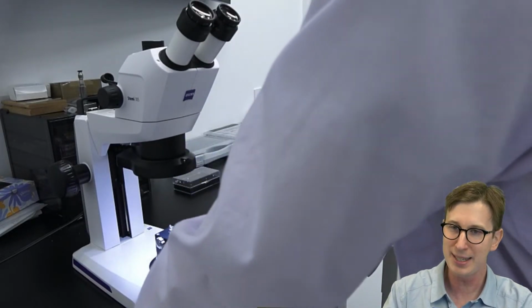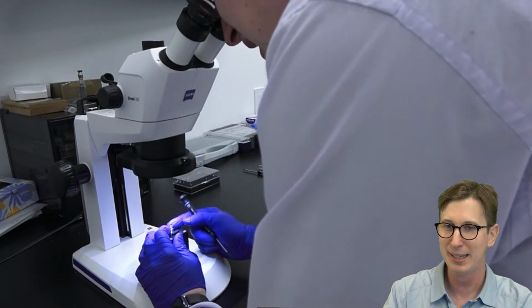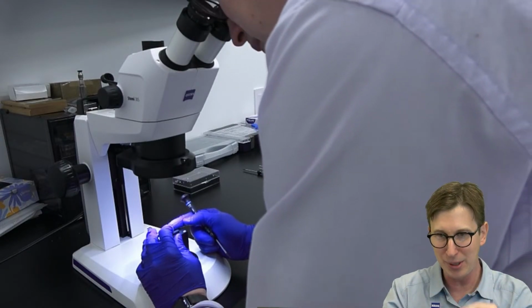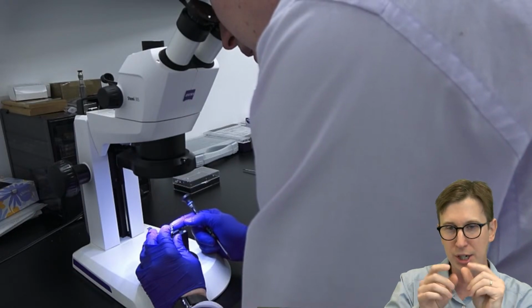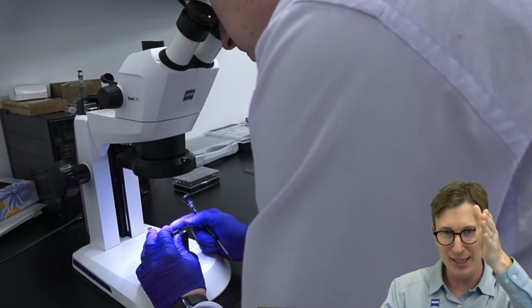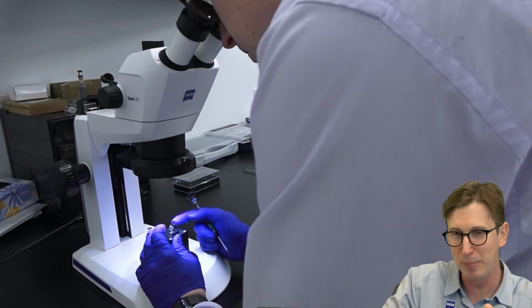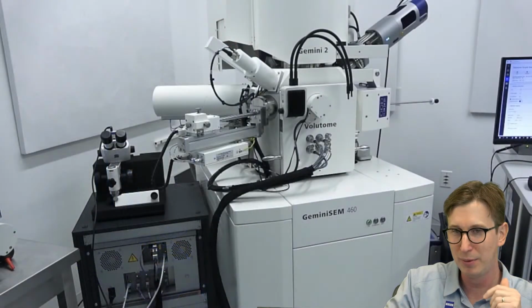And what you can't see here, but that I can see through my eyes in the oculars there, is I have a small crosshair. And that crosshair is telling me where is the center of my sample holder. And what I'm doing there is just using my hands to adjust, to spin around the sample holder to get the pin perfectly aligned. Once that's done, I'll take the sample holder out and I'll tighten it and I'll bring it over to the Volutome where I will vent the stage.